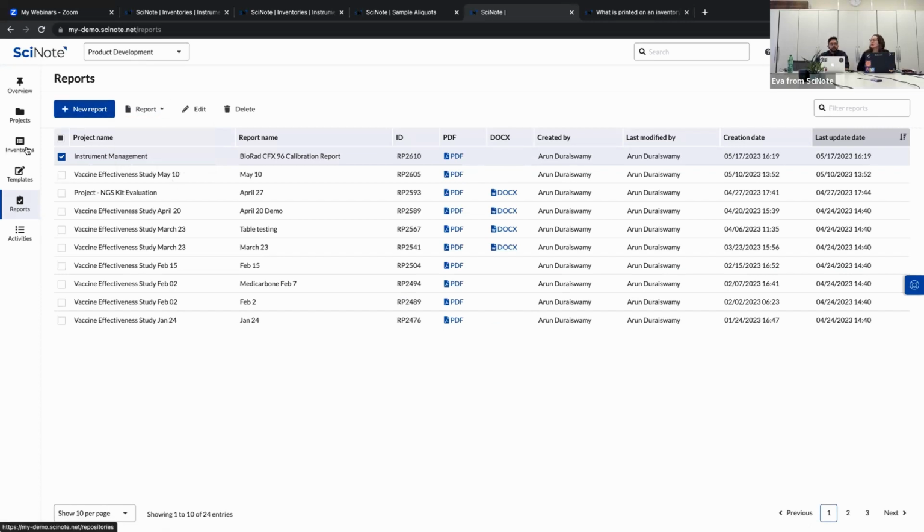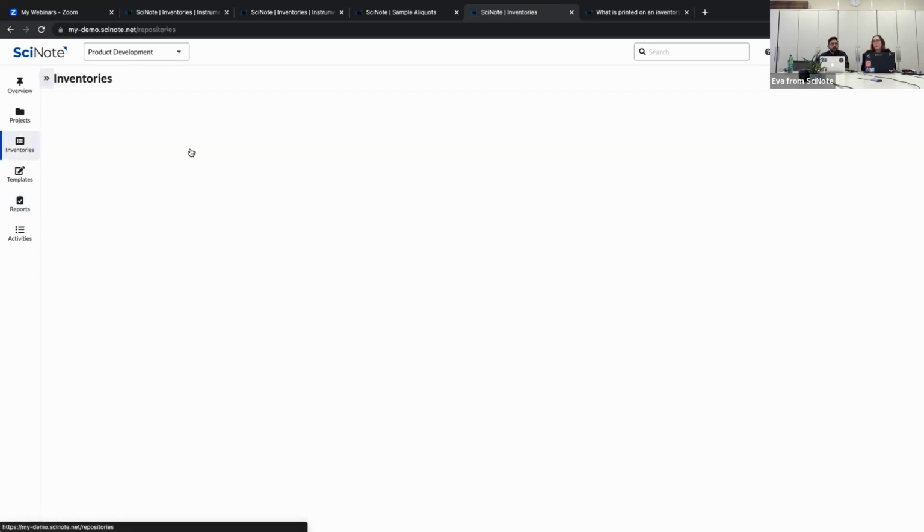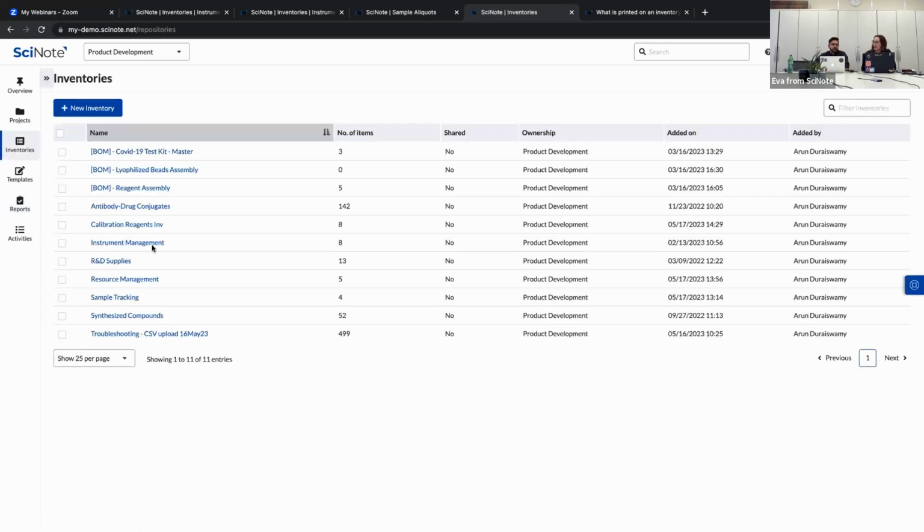All right, so that's everything on the instrument management inventory. Before you go on to the next use case, you might be an expert on this. So we have two questions from Therese. The first one is, can the availability column be something like uptime status? And then how do you make a BOM?